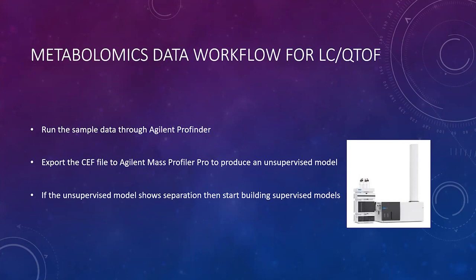There are other ways to extract data from high-res instruments like QTOFs, and they're called mass binning. What we do is bin the masses from the entire output into 0.5 Dalton or larger Dalton windows. So we make windows that are half Daltons each, and from there we can also model that using SIMCA. So it depends. You have choices. You don't have to use the software that's provided with the instrument if you're not comfortable doing that. You can use software that you already know.